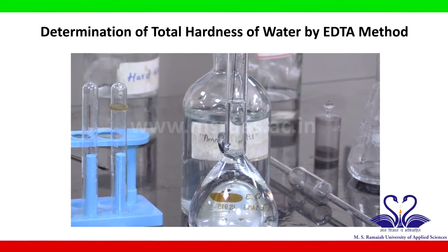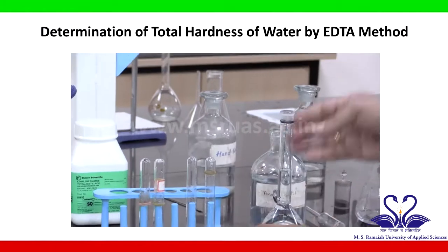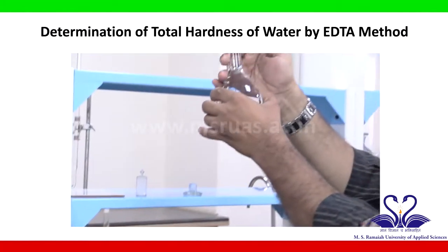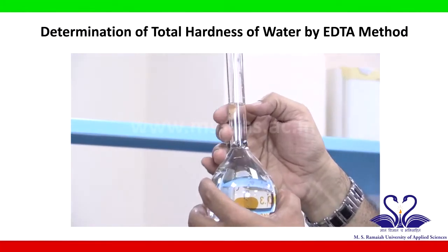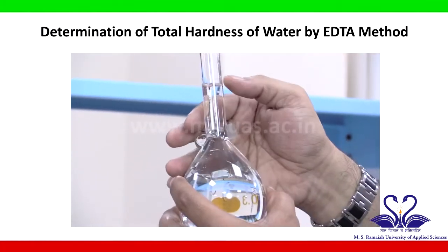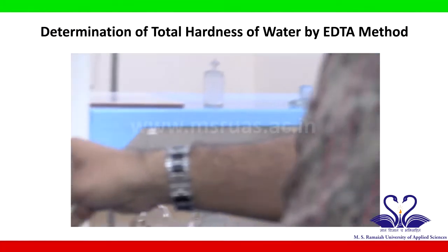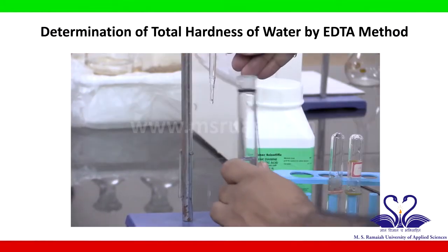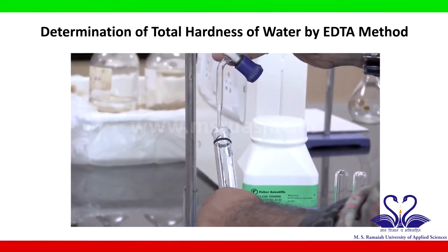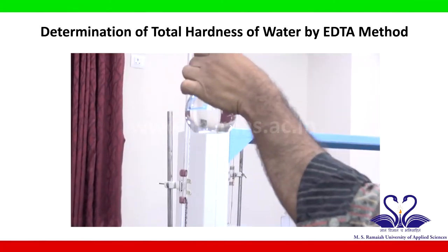Okay. So we can see it is not up to the mark. Still, it is less. So I want a few more drops of water, so I can collect it now. Okay, done.